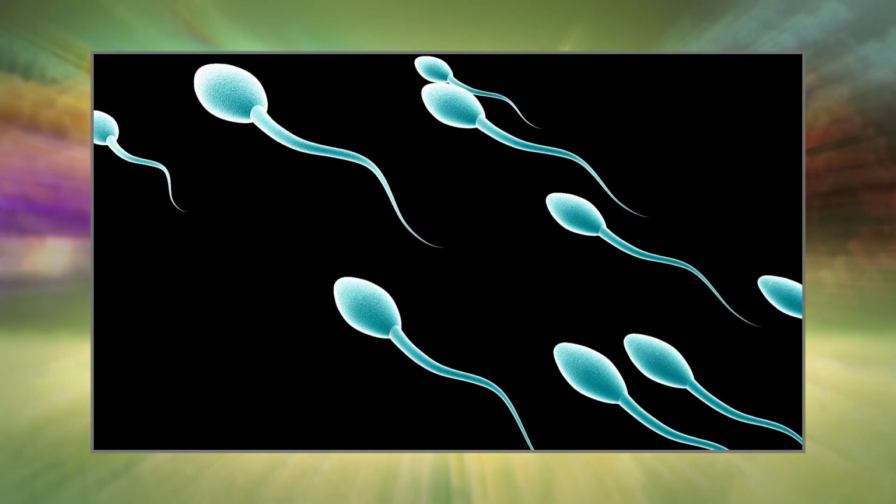Rapid freezing is generally used for preservation and storage of cultured cells for later recovery and plating. It is also used for preservation and later recovery of viable sperm for artificial insemination as well as fertilized eggs.